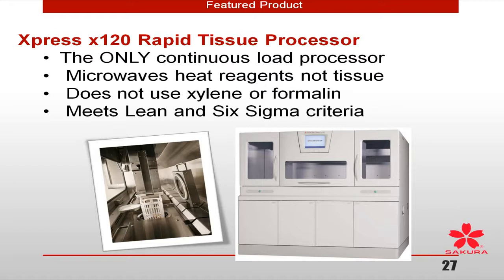Say, just for argument's sake, you have 1 or 2 breast cases a day, think of all the other tissue samples. What it actually allows you to do is work with that breast tissue sample, appropriately sample it, fix it, and then place it onto your processor.